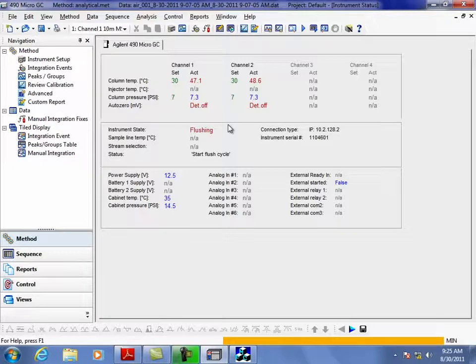Temperature, you will be able to narrow down the gap between nitrogen and oxygen. So actually, what I'm going to do by increasing the temperature, I'm pushing all the peaks closer to the front. And that's going to have the effect of pushing together the oxygen and nitrogen. The theory of chromatography being that there's an affinity. In a mole sieve, it's not so much an affinity, but it's got 5 angstrom holes in a molecular sieve solid. And the gases go in and come out at a different rate. So hydrogen is almost unretained. It goes through very quickly, so it's the first one out. The next one is, of course, oxygen and then nitrogen.